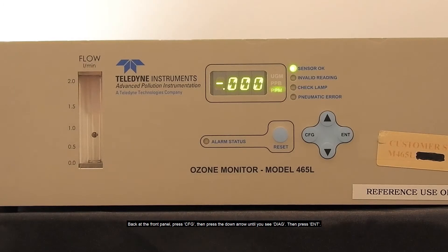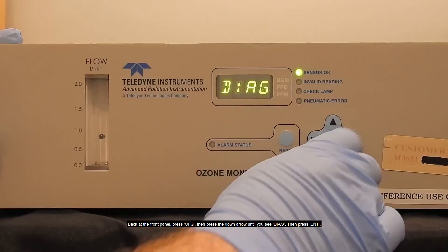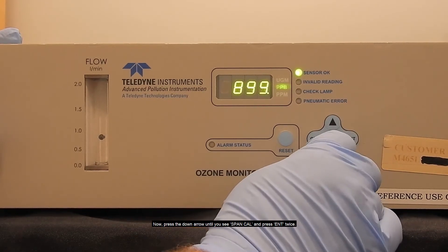Back at the front panel, press config, then press the down arrow until you see diag, then press enter. Now press the down arrow until you see span cal and press enter twice.